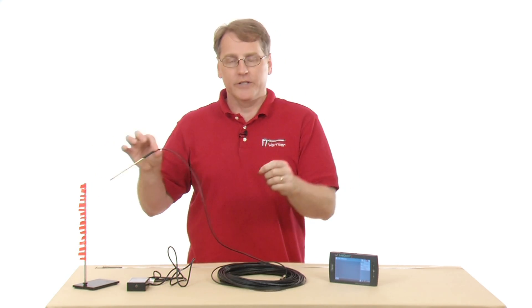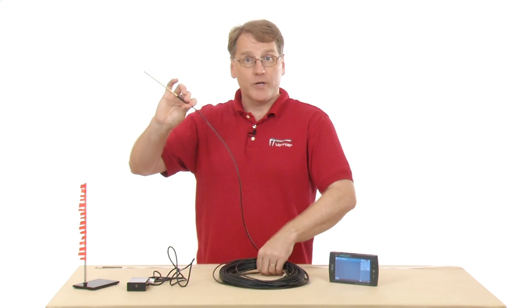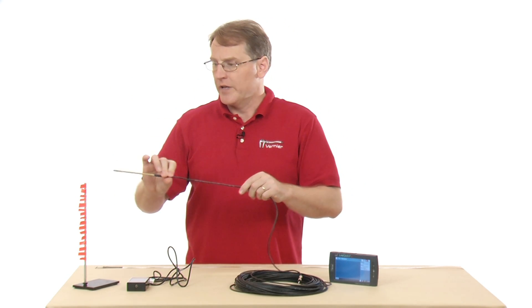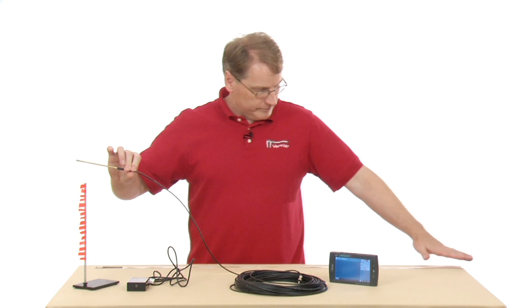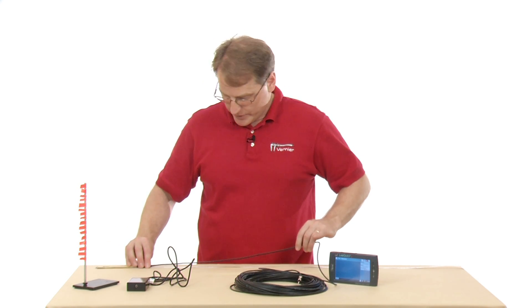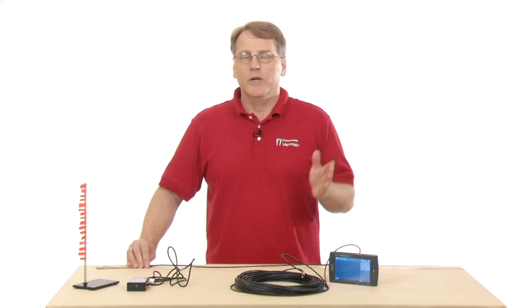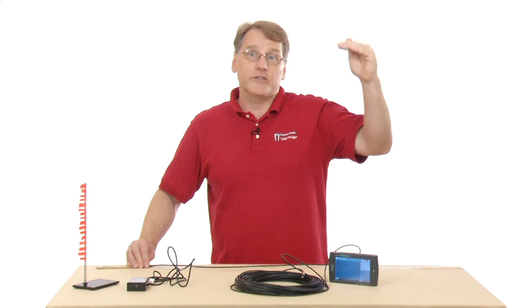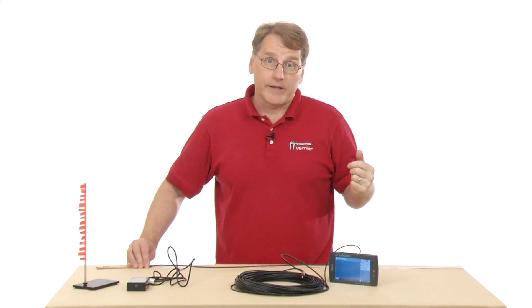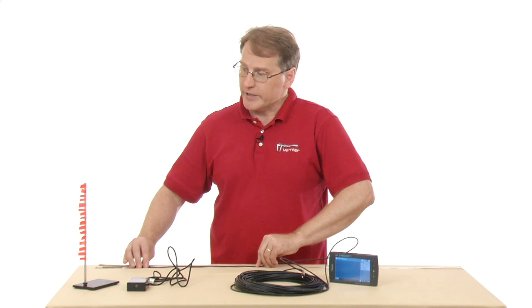I need to know how far down the probe is in the water, and it's not pre-marked. One thing you can do is mark it yourself, or have your students do it. I have a tape measure and some tape I've already cut — I'm using bright orange tape. I'm going to mark this off in 50-centimeter increments, so when I do my collection I can drop it by 50 centimeters and track the temperature profile.